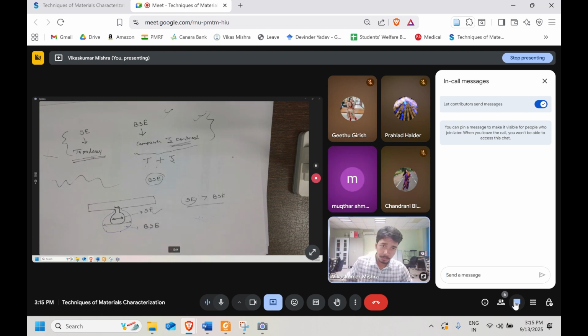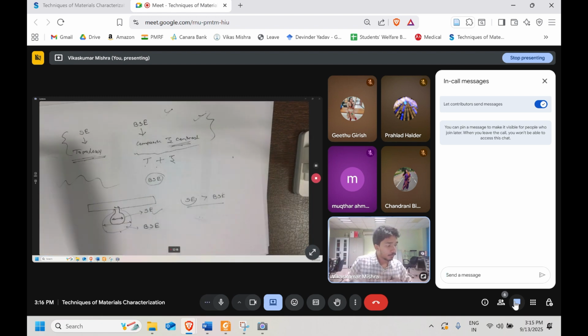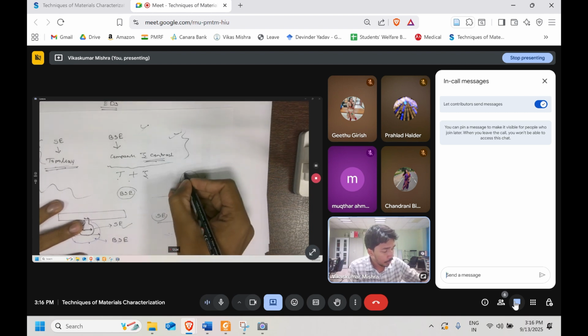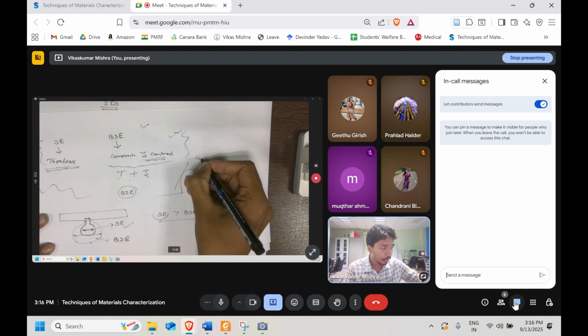Whenever we are talking about the tilting part, let's say our specimen is like this. So this itself is somehow an incline. What we have to be concerned about overall is how the yield is going to affect the contrast. Something is a little bit upside, or hills and valleys are there. It is generating due to the number of yield, the number of electrons.